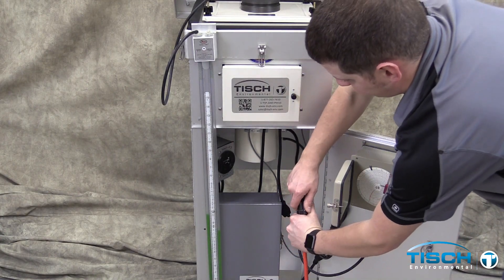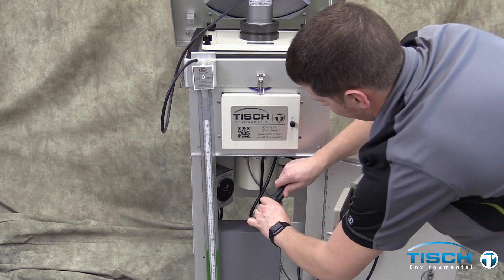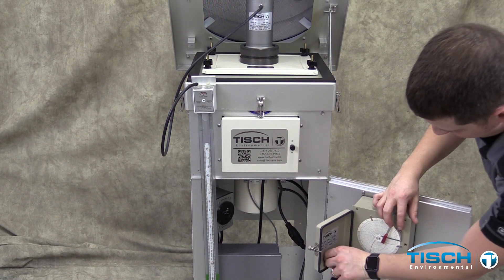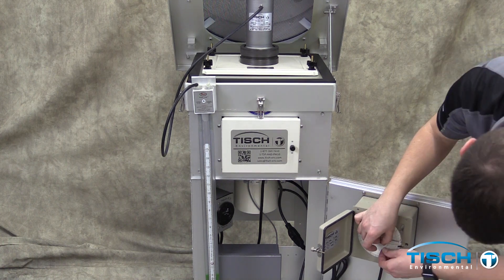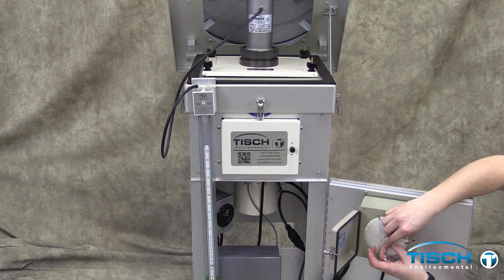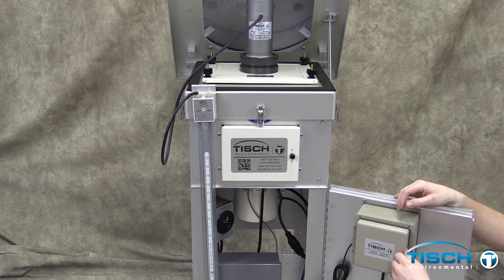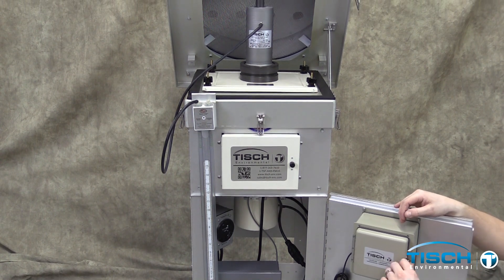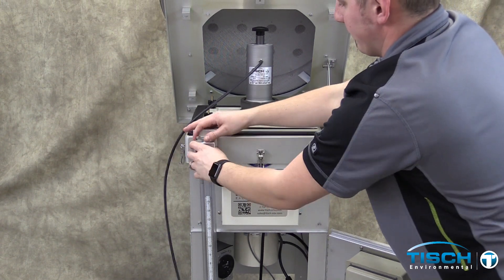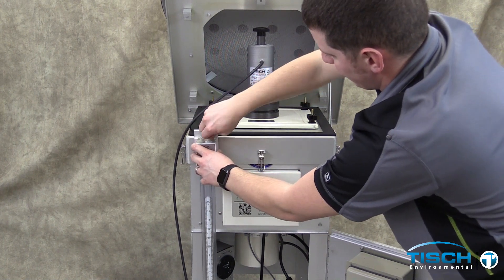Unplug the motor from the power source, then plug the motor back into the flow controller. Replace the cap on the pen of the recorder and close the recorder. Remove the black tubing from the manometer and calibrator. Tighten the valves on the manometer, then remove the calibrator from the adapter plate.